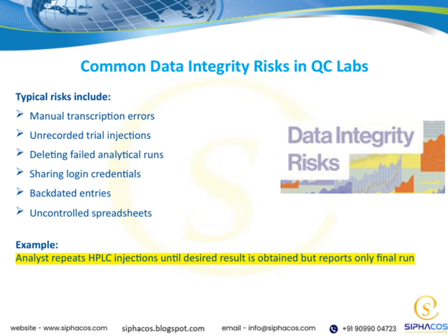Backdated entries pose a serious risk as well. They involve changing dates or times to manipulate the data timeline post hoc. And uncontrolled spreadsheets, which are often used for data tracking, can easily become unmanageable or manipulated without proper controls.